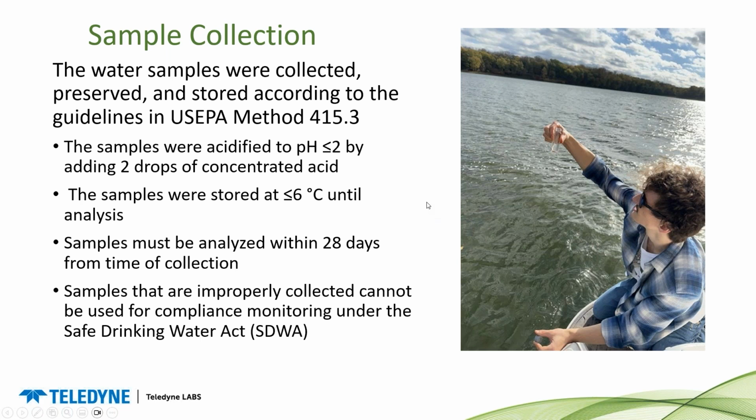Anyway, samples were stored at less than 6 degrees. They were collected in pre-acidified vials to achieve a pH of less than 2. And samples were analyzed within 28 days from time of collection. And all those requirements have to be followed. If not, the samples cannot be used in compliance with the Safe Drinking Water Act established by the EPA.